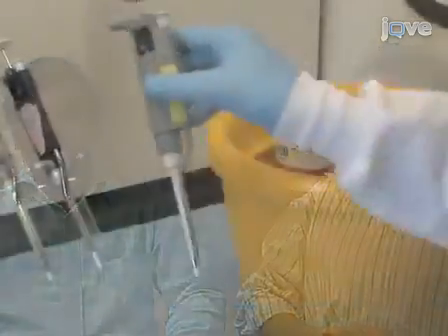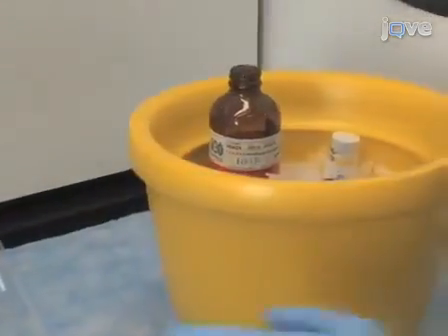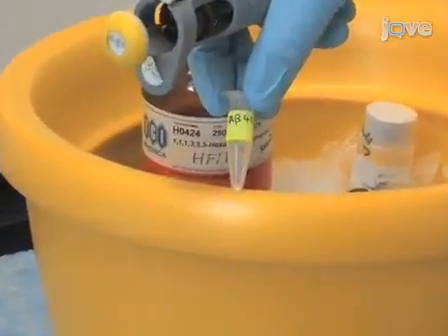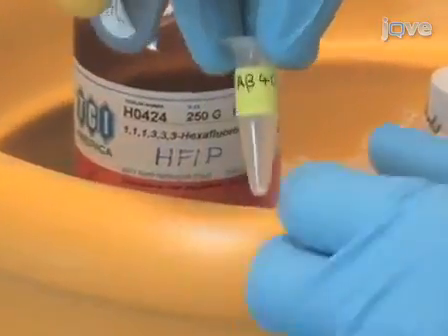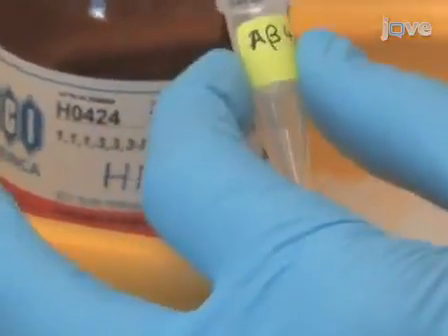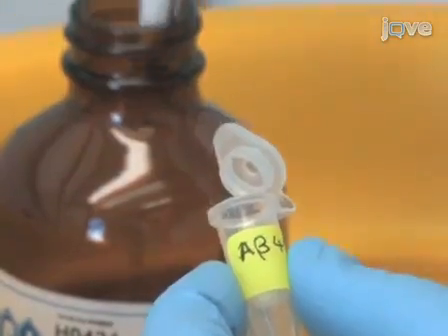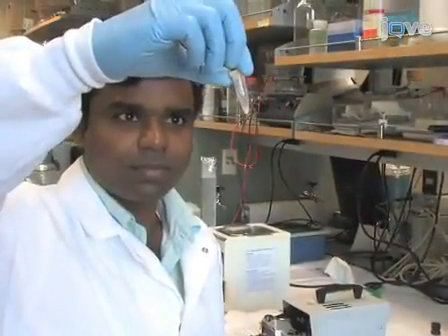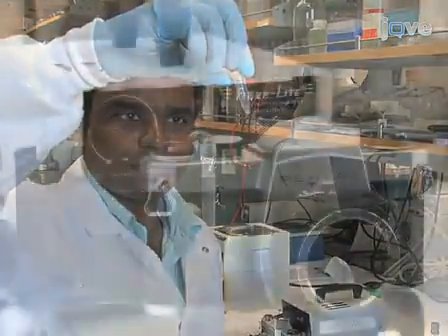Hi, I'm Farid Rahimi from the Bitan laboratory in the Department of Neurology at the University of California in Los Angeles. I am Panchanan Maiti from the Bitan laboratory. Today we will show you a procedure for photo-induced cross-linking of unmodified proteins. We use this procedure in our laboratory to generate stabilized amyloid beta protein oligomers and study the effect of structural modifications on the oligomer size distribution.